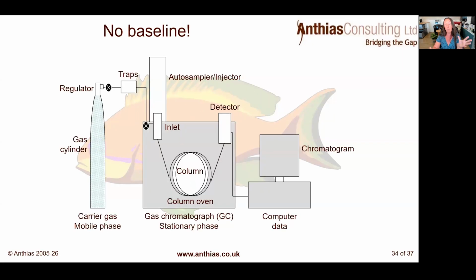Generally, if we've got peaks on there, then it's not going to be our carrier gas, because our carrier gas would affect our peak shapes and our retention times. And this question doesn't mention any of those problems, so it's probably not going to be our carrier gas flow path. What about our sample flow path? We're seeing those peaks, so it's probably not the introduction. It's probably not getting onto the column, because it hasn't been mentioned that the peak shape quality has reduced.